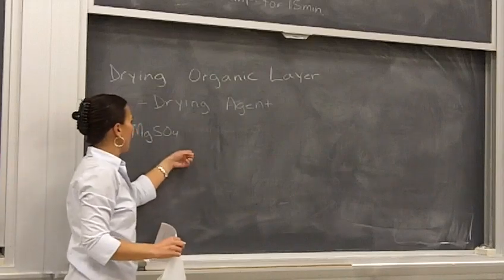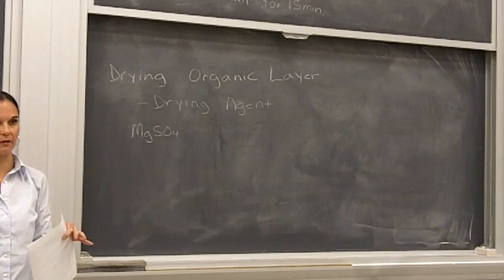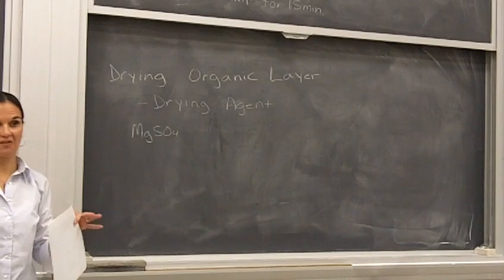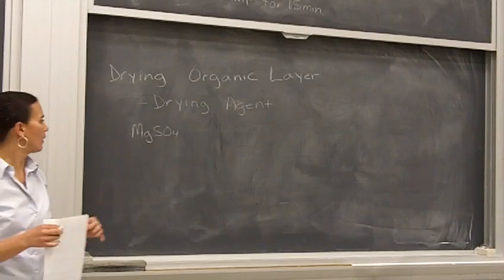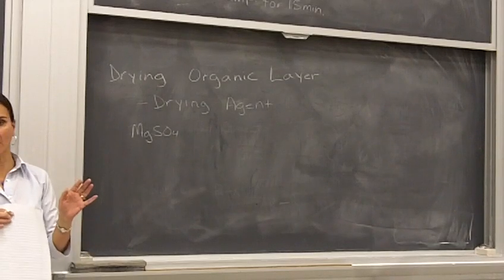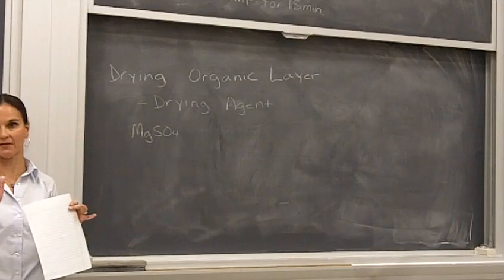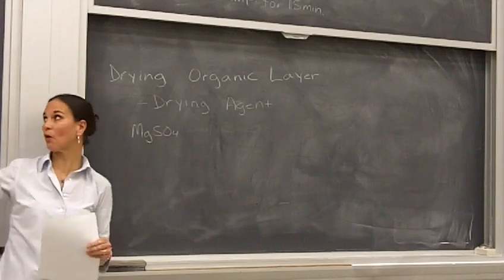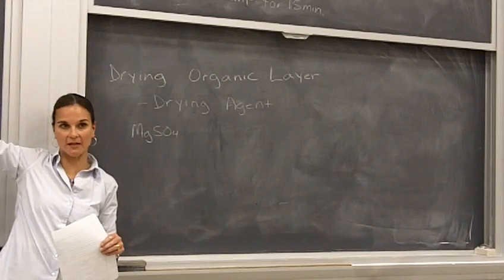Okay? So the magnesium sulfate. So first of all, magnesium metal. What is magnesium metal going to look like? What you set up your reaction with? It's metal. It's shiny, right? Shiny silver metal, right? I'm testing you on it because the magnesium and the magnesium sulfate are both sitting by the balances. So you got to pay attention to which to use when, okay? So setting up your whole reaction, your Grignard reagent formation, magnesium, the shiny metal.